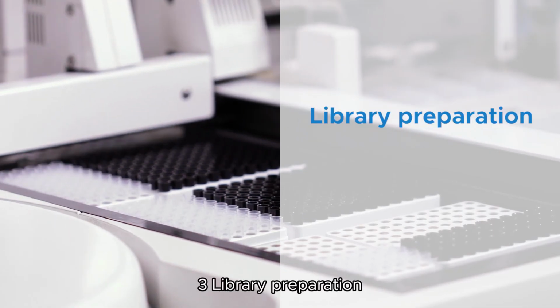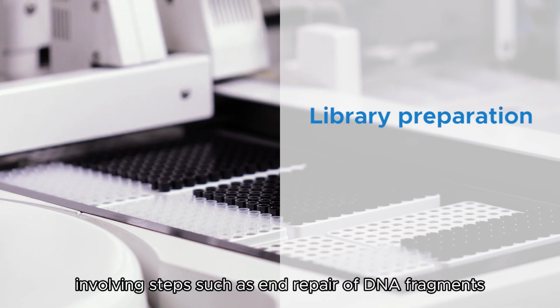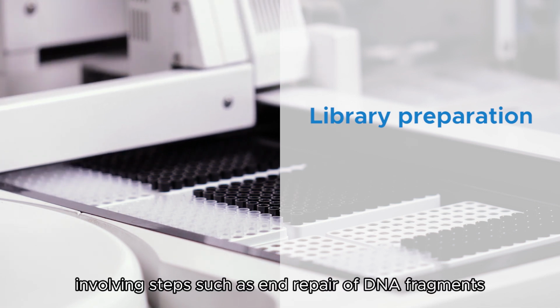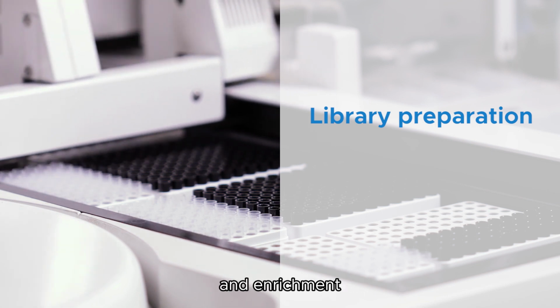3. Library preparation. The PCR amplification products undergo library preparation, involving steps such as end repair of DNA fragments, adapter ligation, addition of index primers, fragment size selection, and enrichment.